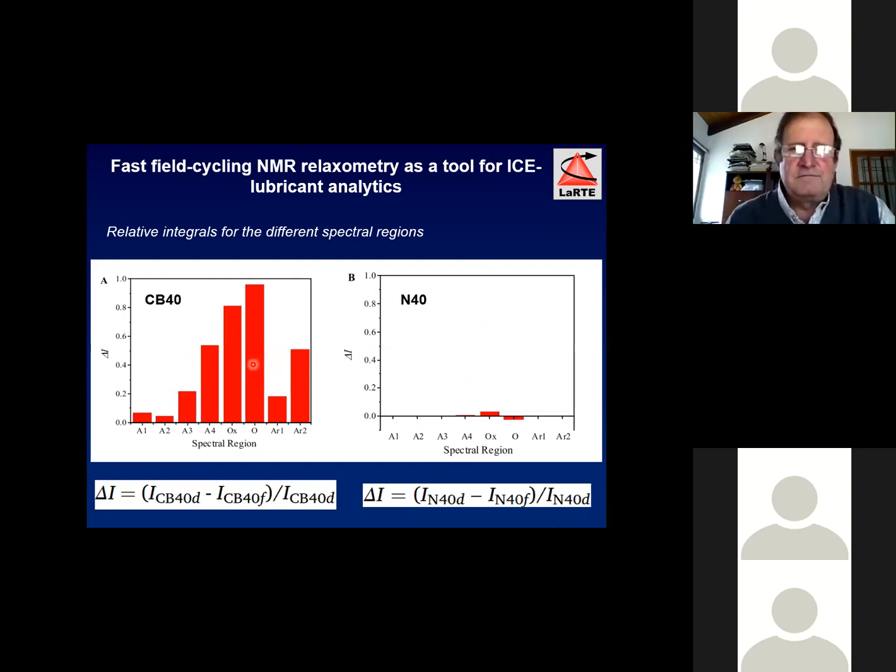Okay, this is exactly the same, but shown in a different way, just integrating the spectrum in the different spectral regions. So you see strong changes in the base and practically no changes in the lubricant with the additive pack. So we can say that the additive pack is fully active here, even after the 17 hours, sorry, at 270 degrees. So there was important degradation in the base, but not in the full lubricant. So the pack is working.